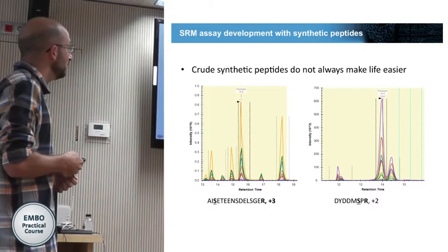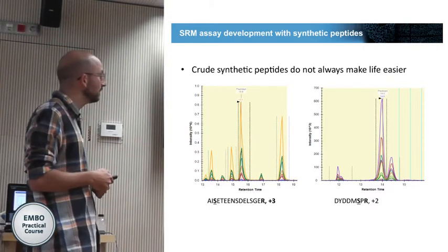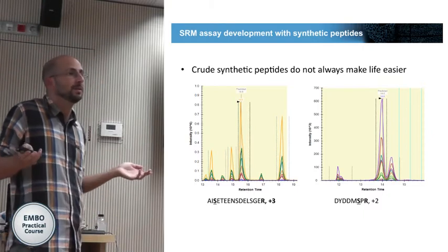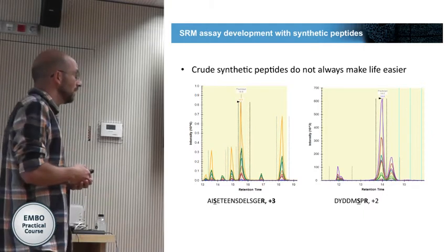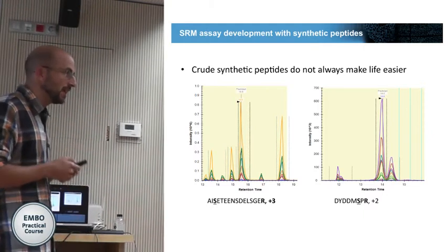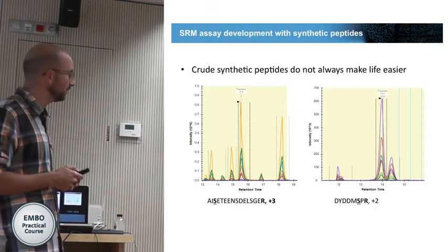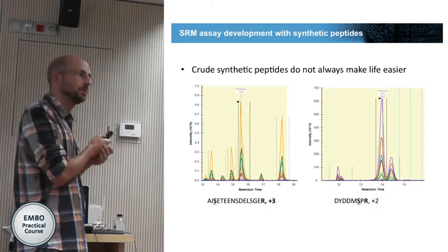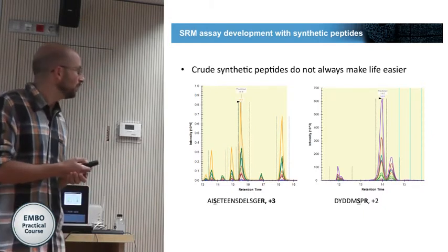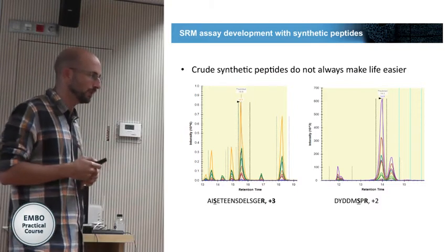They have completely different retention times, so it's very complicated now to say what is the predicted retention time, and most importantly, you have no idea which one is the right one and which one will correlate with the endogenous. So I always say heavy references are super useful, and sometimes they are actually quite complicated to use. It's not a very common case, it's actually quite rare, but I prefer to show this slide so that you know that sometimes it gets complicated also using the heavy reference.